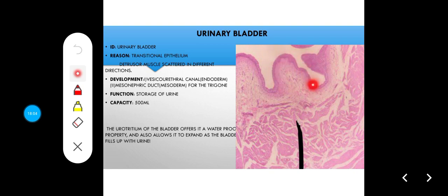So you have the mucosa, the lamina propria. It kind of looks like the submucosa visually, but it's not the submucosa. Some people might mistake it for the submucosa, but it's not a real submucosa, just like in the ureter. So the term submucosa is just a kind of visual differentiation to help you identify the slide on the image, but it doesn't contain a real submucosa. The submucosal layer is not distinct.